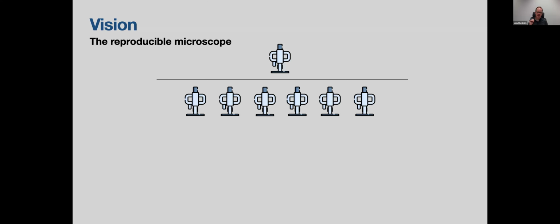And of course, there's a great value of having many microscopes in the lab. It would basically allow you to have an instrument for every student or every postdoc in the lab, and so it increases your throughput and output. And as I said earlier, I see more value in having many microscopes than having just a single microscope that may be 5%, 10% better, but you only have one of these.